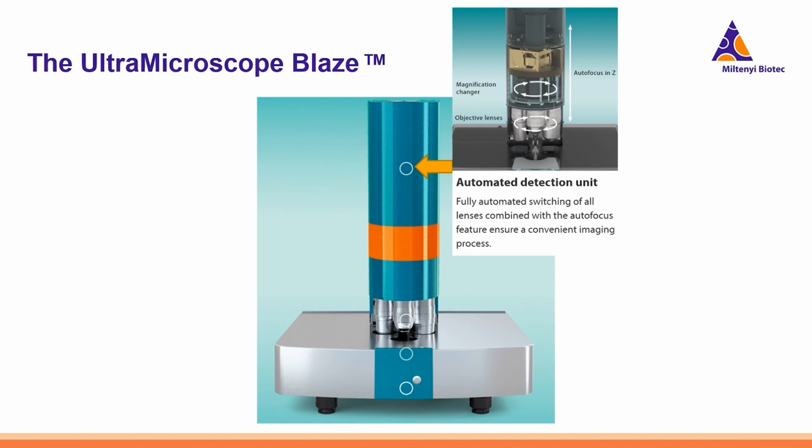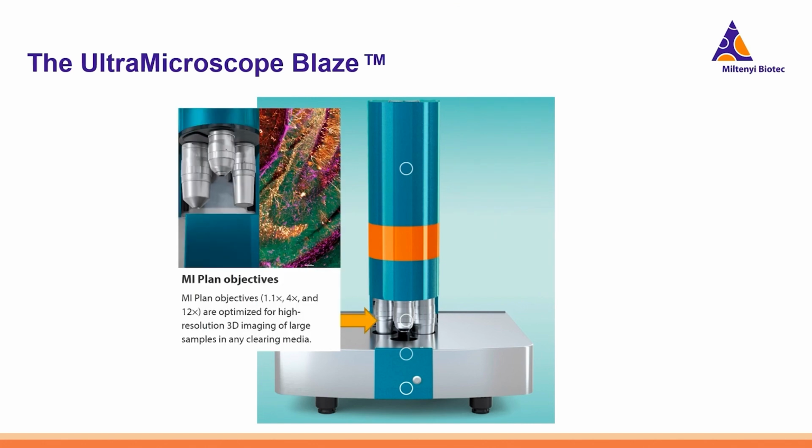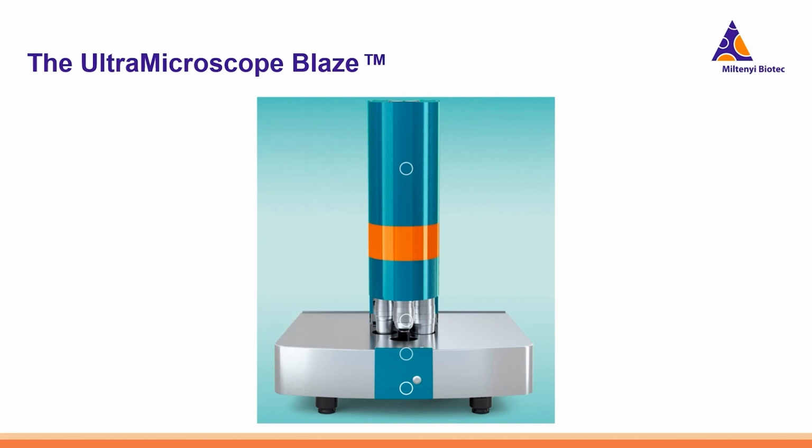Inside the unit itself, there are 4 intermediate lenses providing a range of magnifications that can be applied to each objective. We have the multi-immersion plane objectives. This system is equipped with a 1.1x, a 4x, and a 12x objective. These lenses are specifically designed for light sheet microscopy, having the longest working distances relative to their numerical aperture.